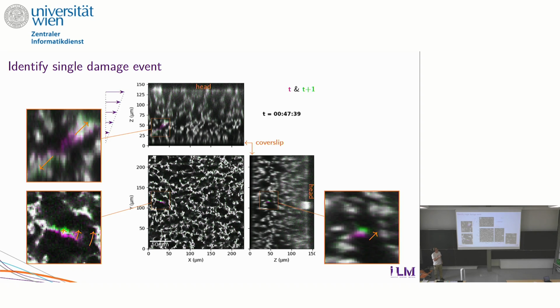But what is not completely trivial is that if you look in perpendicular planes, you see actually all the displacements that are out of the shear plane, meaning that you have a coupling between the local geometry, the local topology of the gel, the local anisotropy of the gel, and the release, the way the strand will move once it's broken. All right, so that was not completely expected.